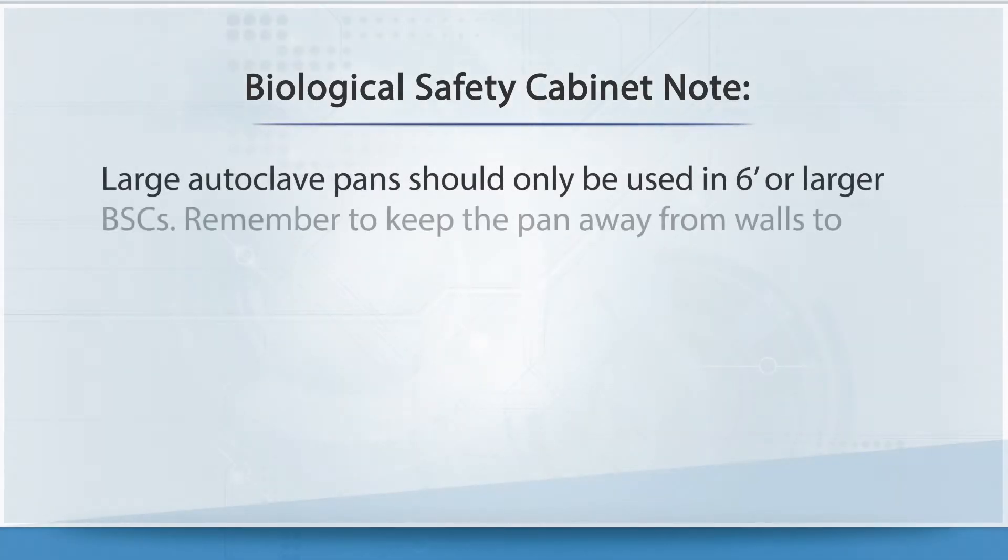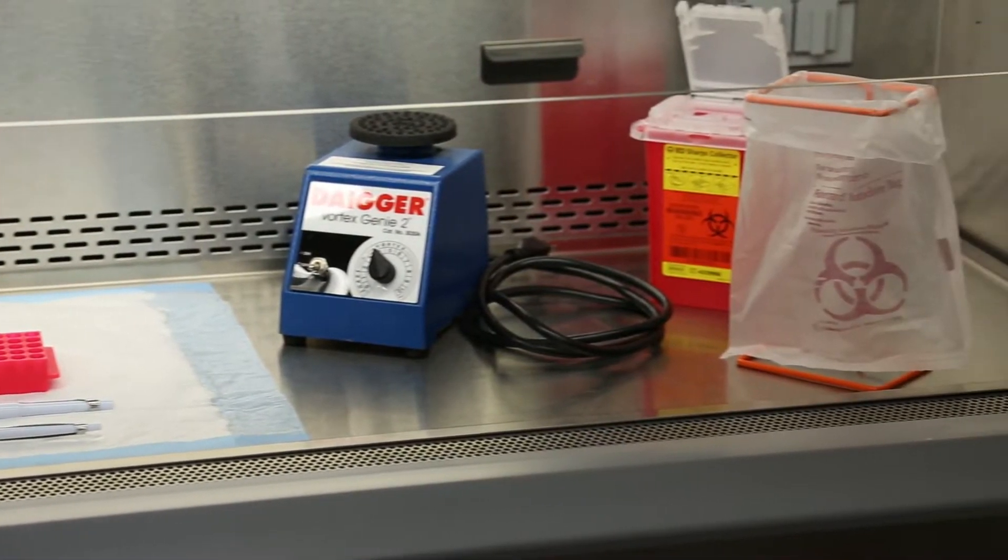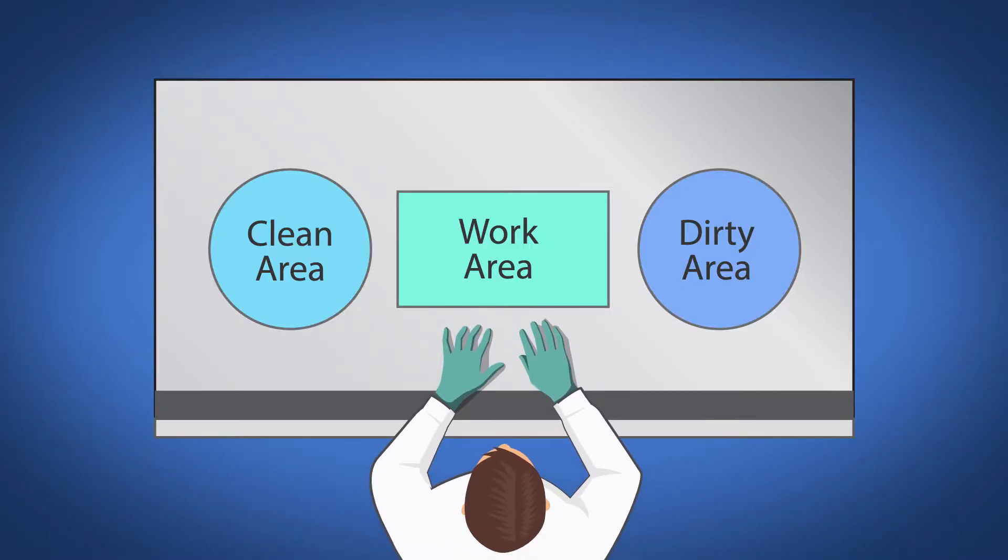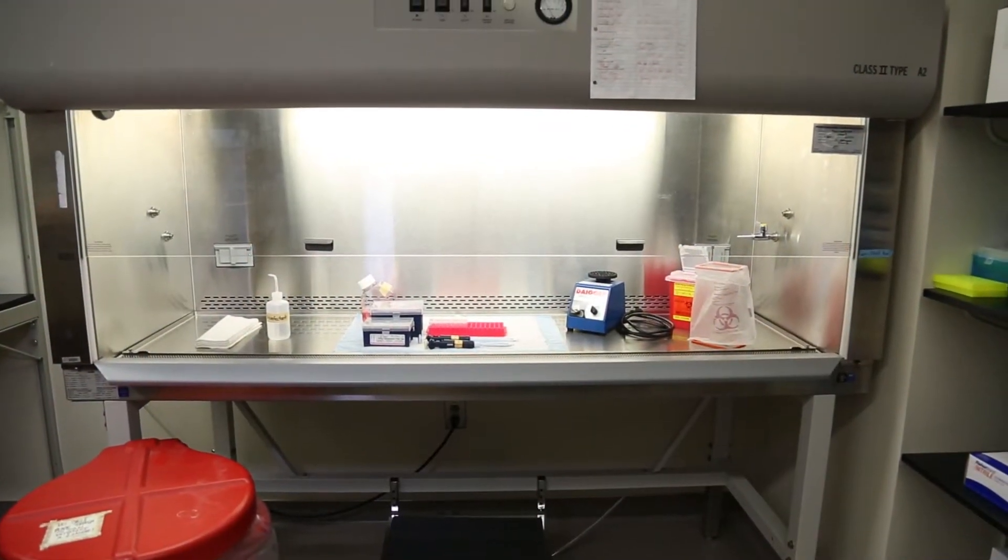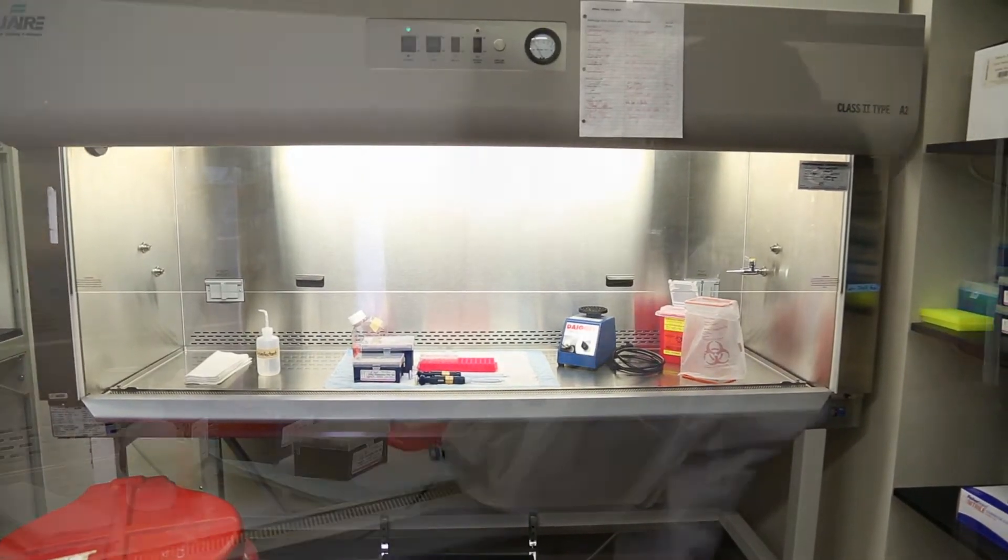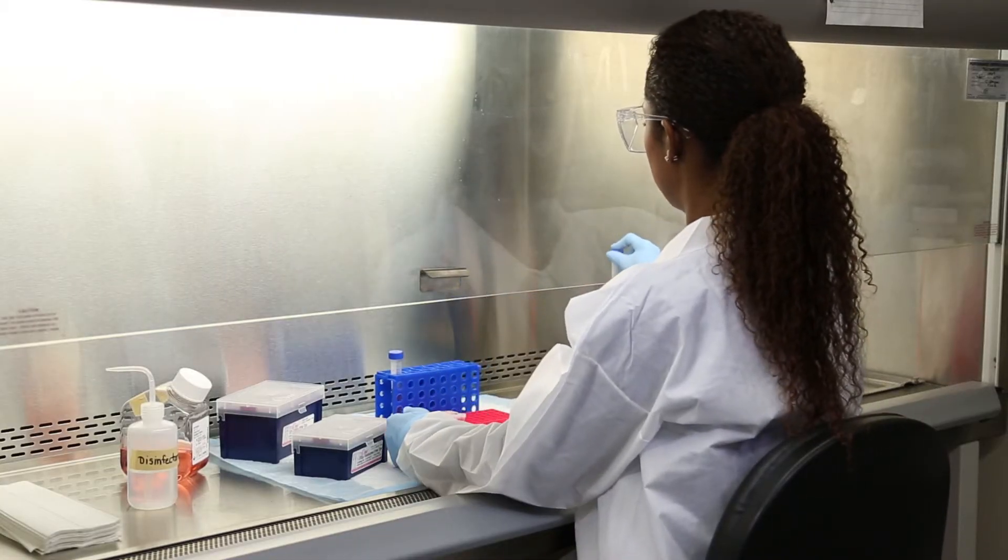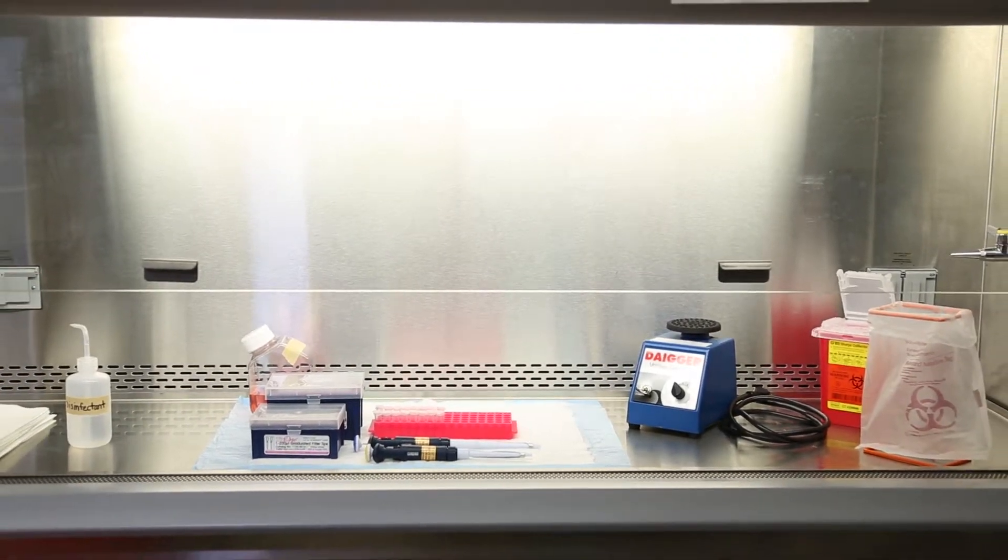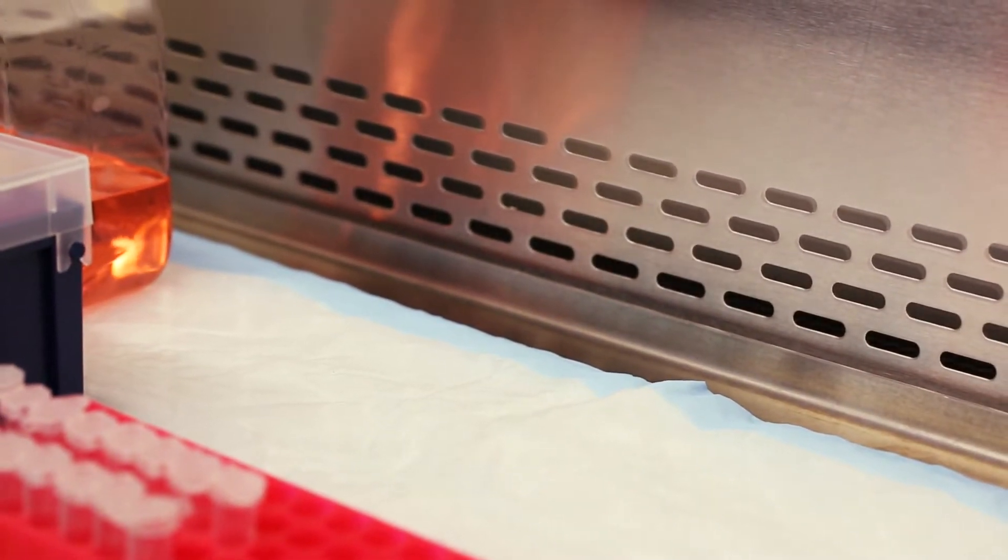Please note, large autoclave pans should only be used in six-foot or larger BSCs. For smaller BSCs, alternative biohazardous waste containers or bag stands should be used. Remember the clean-to-dirty principle and place clean materials on one side of the BSC and the biological waste and sharps container on the opposite or dirty side. In this video, we are demonstrating placement of materials for a right-handed person. Materials would be reversed for a left-handed person. Remember to keep the front and rear grills unobstructed to avoid disrupting the airflow in the BSC.